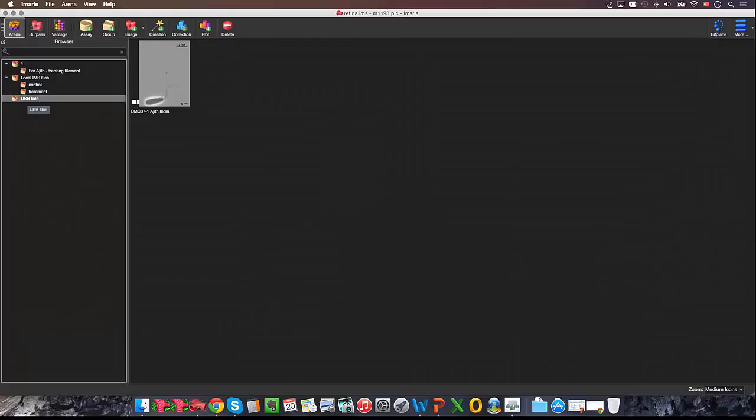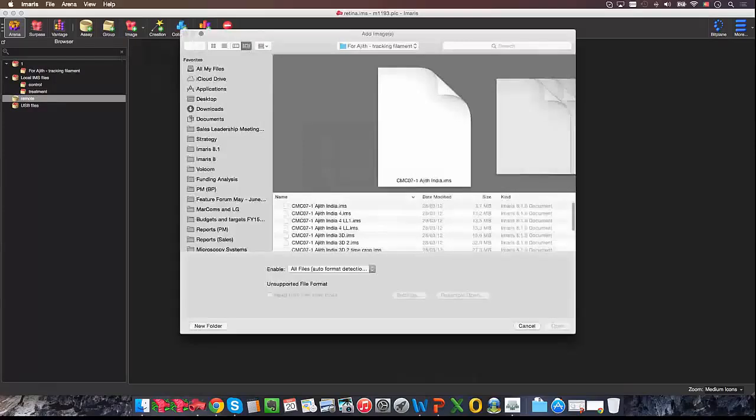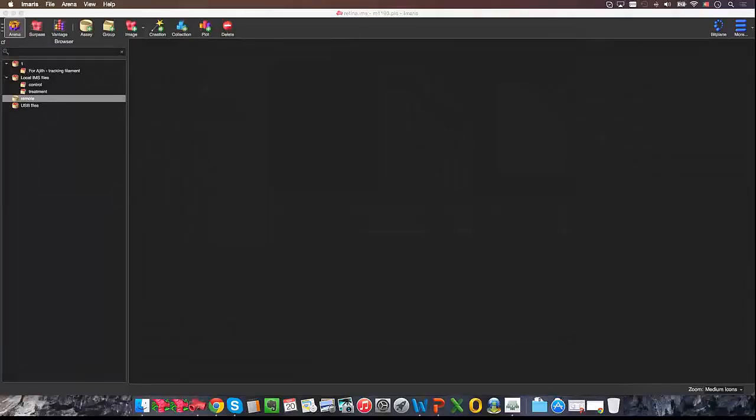And in addition to that, I can have remote, really. And in here, I can add an image from a network drive. So I can go into, oh, this is dropped out. So I had a network drive here earlier, but you can go into basically a network drive, go to the folder of interest, click on that, and it will show you a thumbnail of that image. It's not copying your image to your disk at this point, not yet. It's just creating a link and showing you a thumbnail.